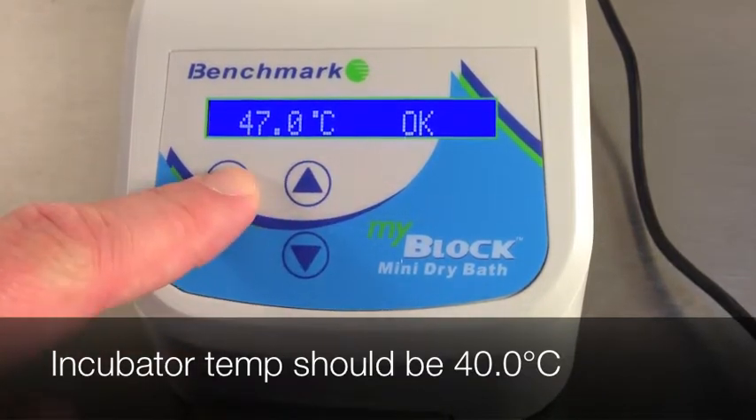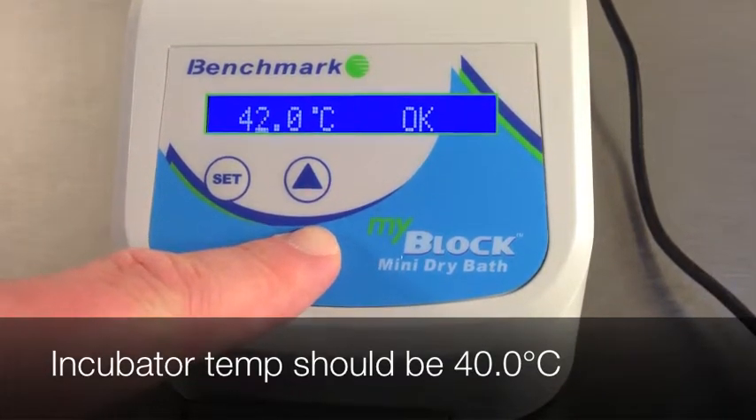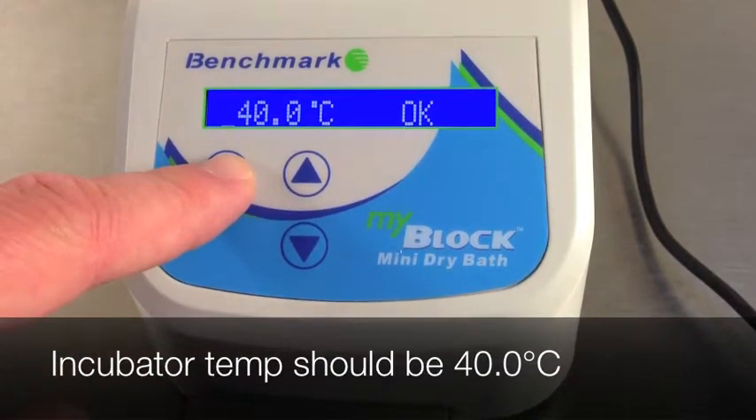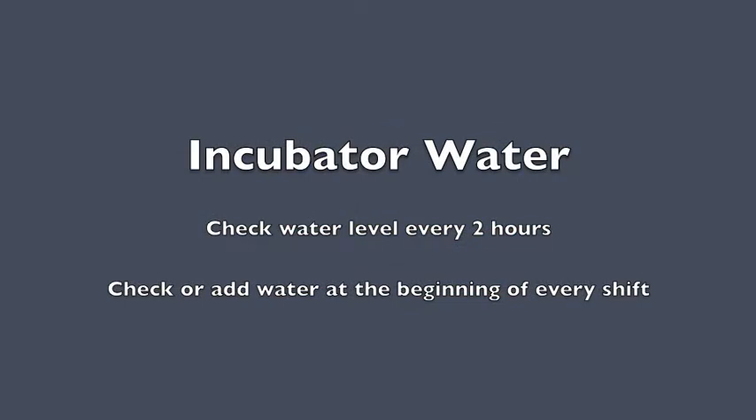The incubator should be set to 40 degrees centigrade. To set the temperature, press and hold the set button and use the arrow keys to adjust the temperature. Check the incubator water level every two hours and always add water at the beginning of every shift.